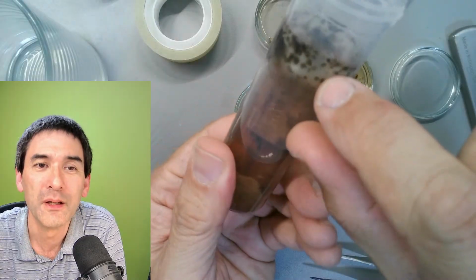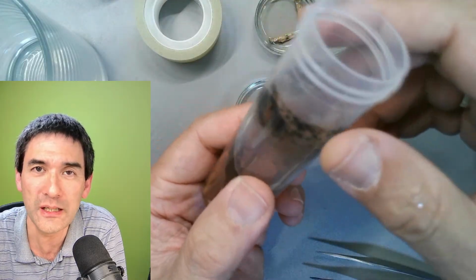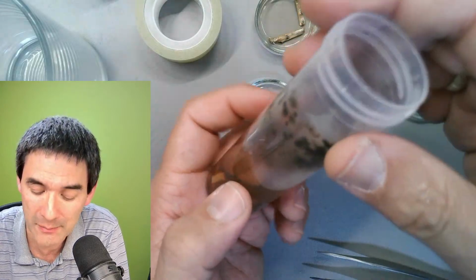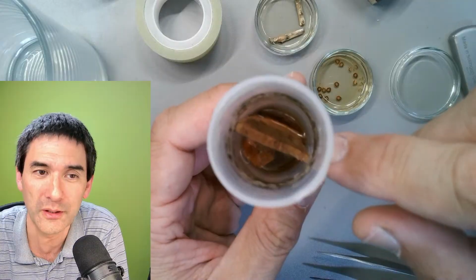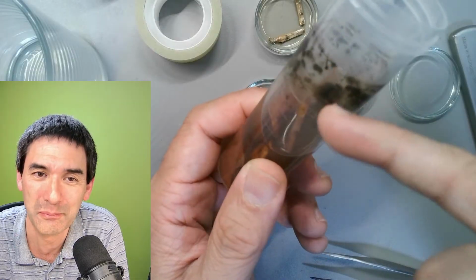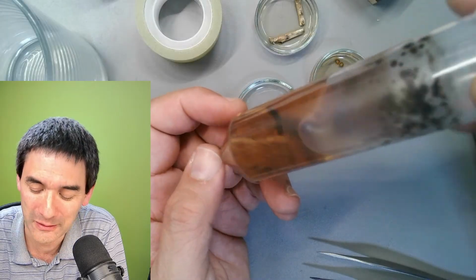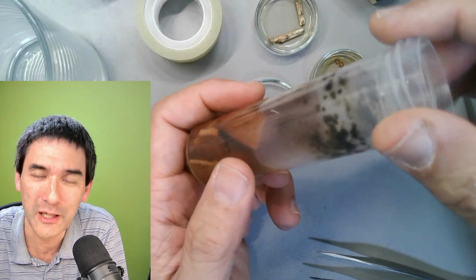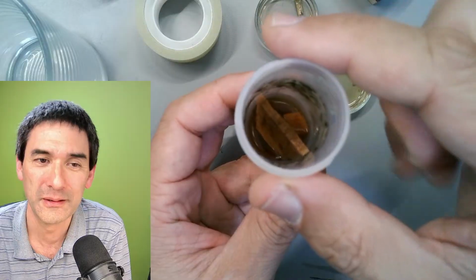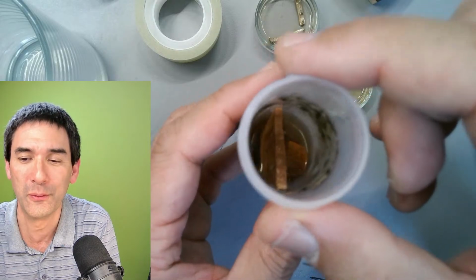Yeah, it got moldy. The thing is the following: if you have pure glycerin, then organisms have a problem growing because the pure glycerin withdraws water. But if you mix it with water, then of course mold can grow. So this is something that I should not have done. You see, it's pretty disgusting stuff. I should have been a little more careful, because of course it becomes moldy if organic substances are in here. Obviously, there's plenty of nutrients for fungi to grow.